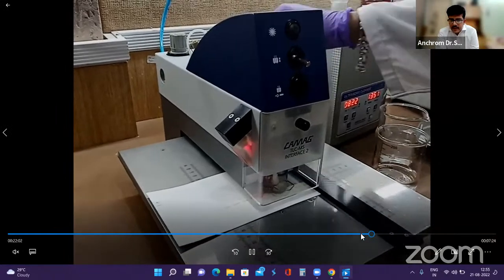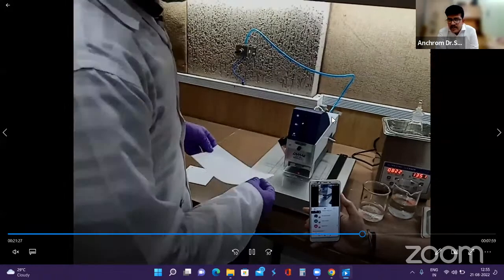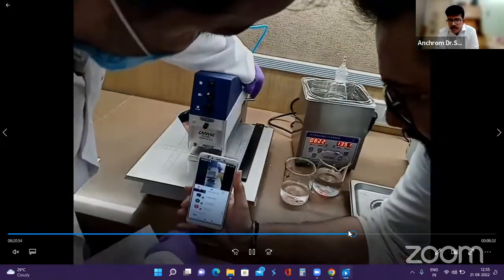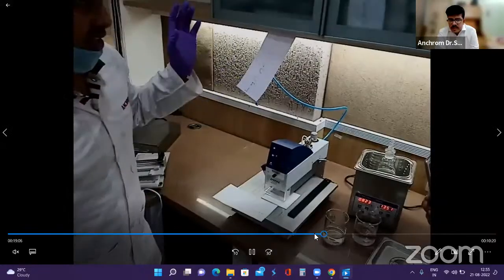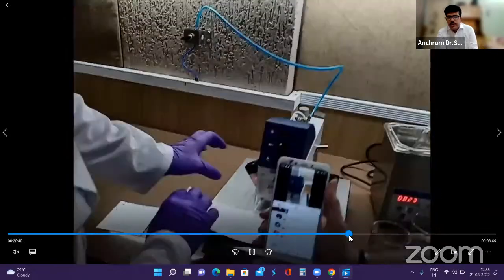And this is the elution which is being shown. So there is this extraction lever on the right hand side. Solvent from the pump is coming onto the top. If you see, let me show you on the top. I'll go a few seconds back. Anyways, we'll see a dedicated video of this.